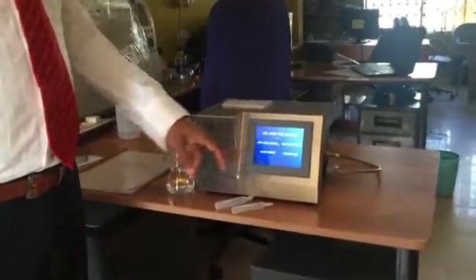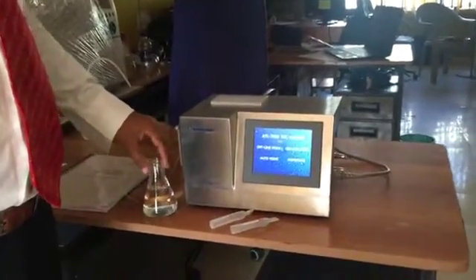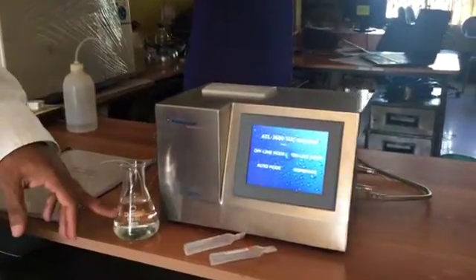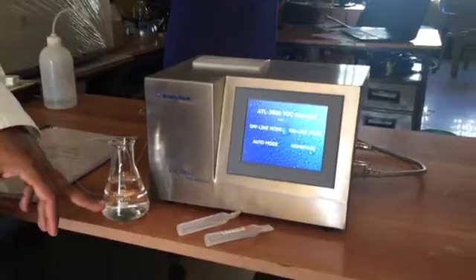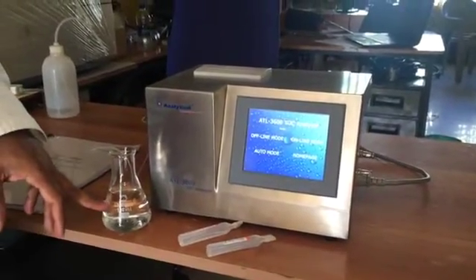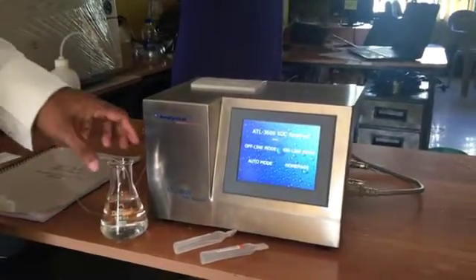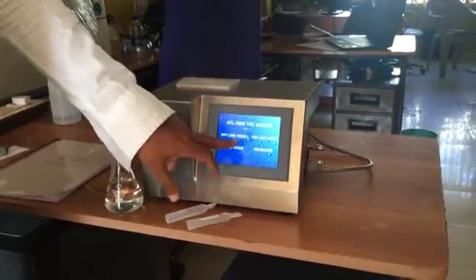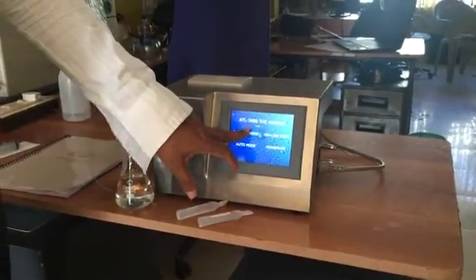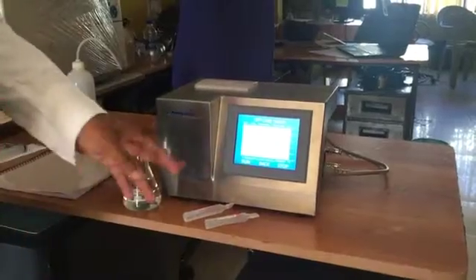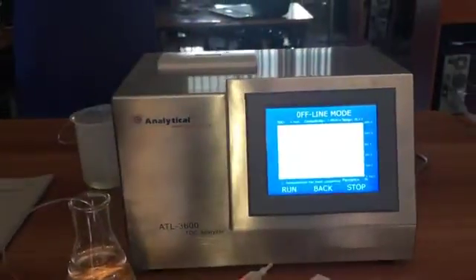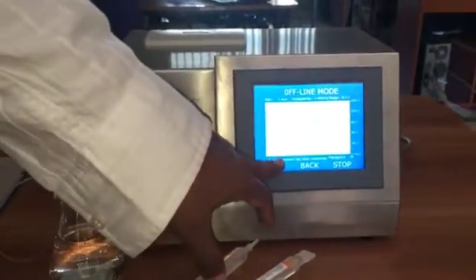Now, for example, we want to test the water — the drinking water, the output of a Reverse Osmosis (RO) system. So now I am going to do the test. I choose Offline because it is not connected online to any system. Once you select Offline, you get a screen like this, then you run it.